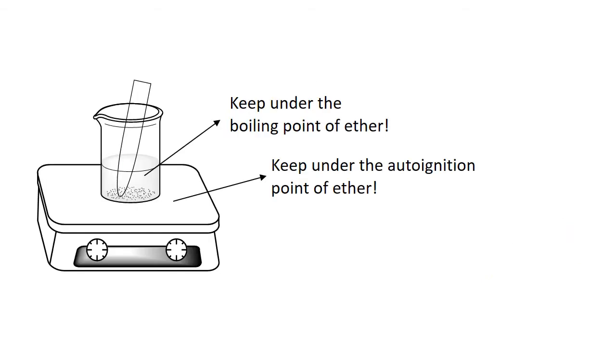To set up this reaction, we are going to dissolve maleic anhydride in ether and then later add the furan. If you can get it to dissolve without warming, that's fine, but usually it helps speed things along if we warm up that test tube to get it to dissolve. We're going to do this in a warm water bath.